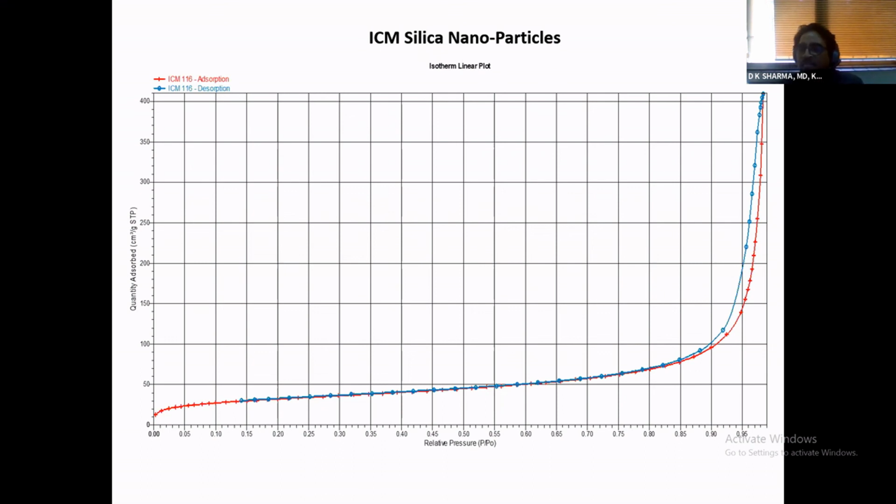The size is so small that the void volumes fall in the range of mesopores. Okay, and that's why it is a void space. It's a void volume which renders itself to be as good as a mesopore. How do we know that it's not a mesopore, it's only a void volume?